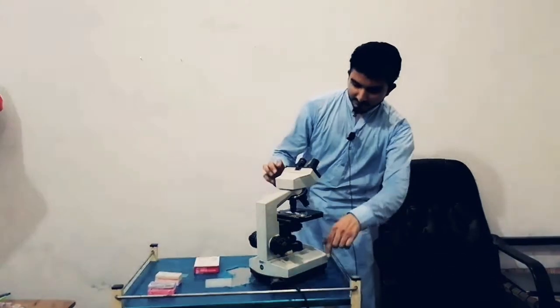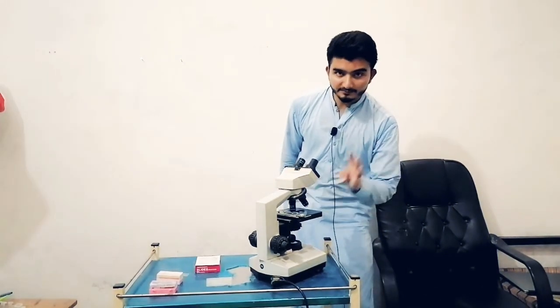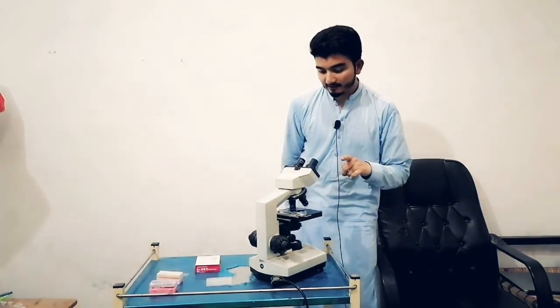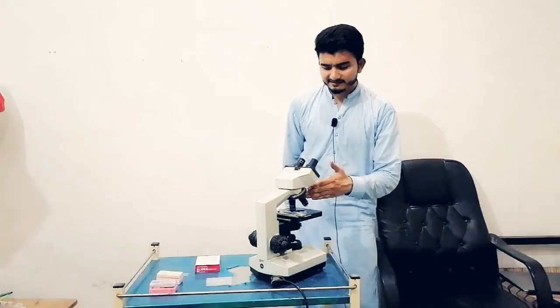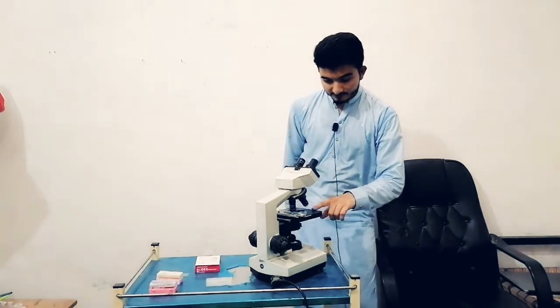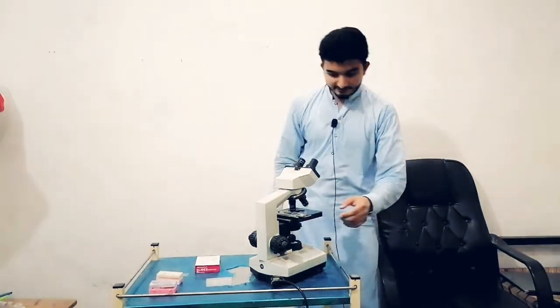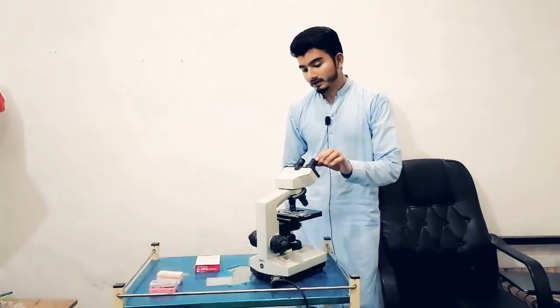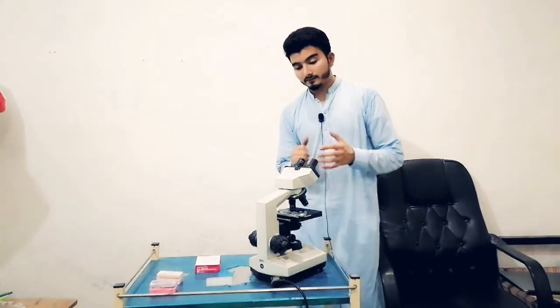And yes, we have the eyepieces, and we have the special 4 objective lenses. The lenses are 4x, 10x, 40x and 100x. There are different uses of these lenses. These are called objective lenses, and this is the stage where we put the sample. And this is the arm, this is the body, this is the nose piece. These are the ocular lenses, also called eyepieces. So these are the parts of the compound microscope.